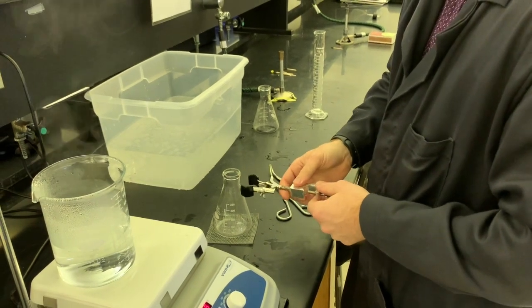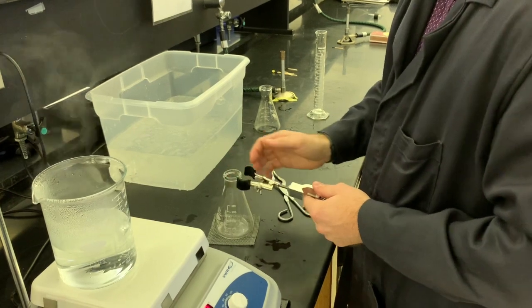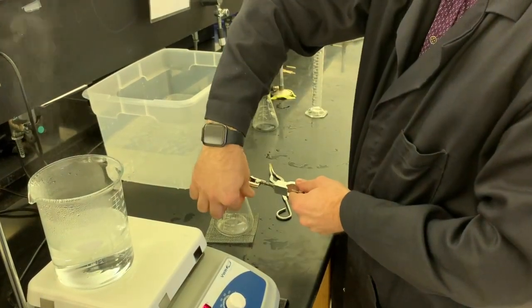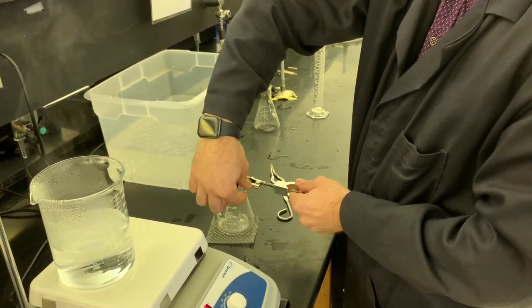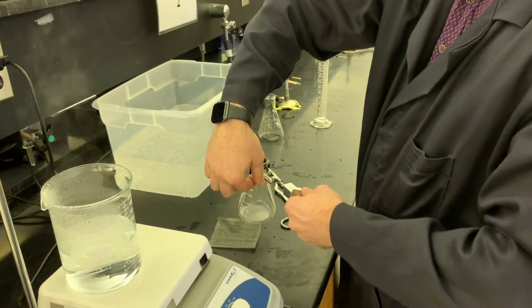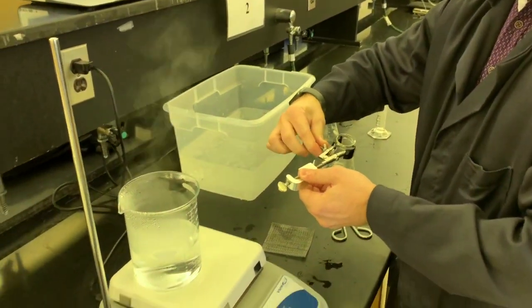It's not too big a deal. It's going to let it cool down a little bit, but for the most part, the flask will probably stay put that way anyways, so that's fine. A little bit of plastic won't hurt what we're doing today.